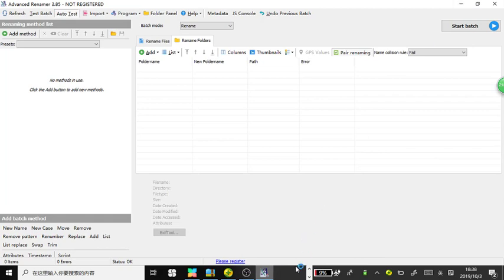Images from microscope and other devices can be processed in batch using a loop in macroscript with ImageJ, but the irregular names of the images always cause a problem fitting the images into the loop of the macroscript. In this video, it will be shown how to use the Advanced Renamer to rename the images so as to make them follow a pattern and fit into the loop for the macroscript.